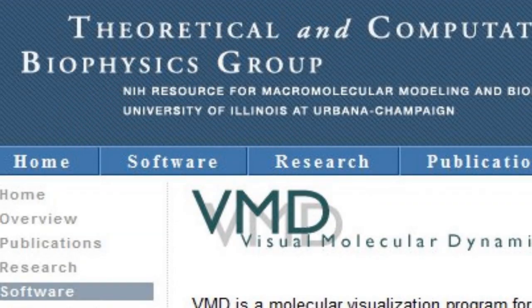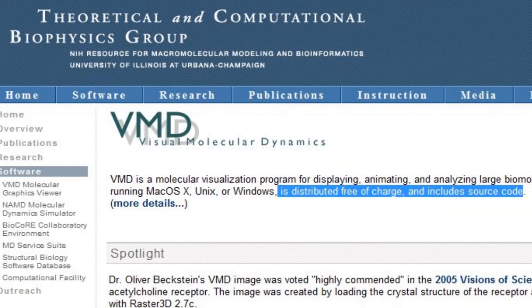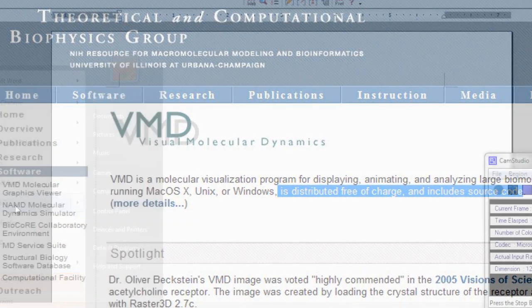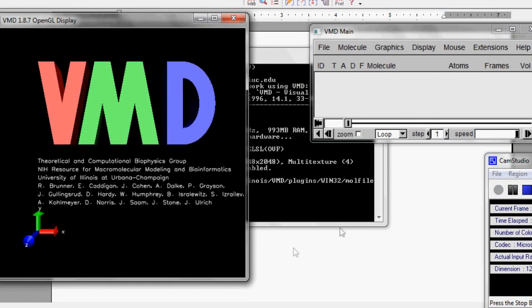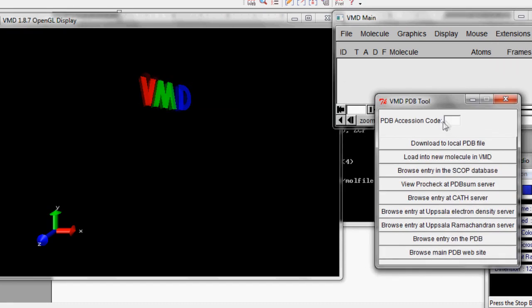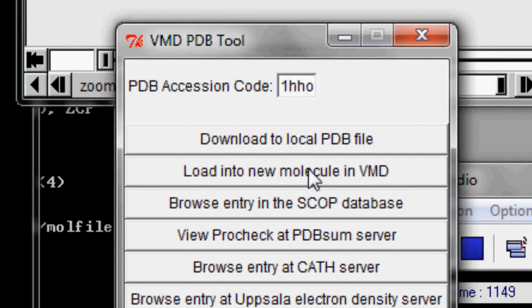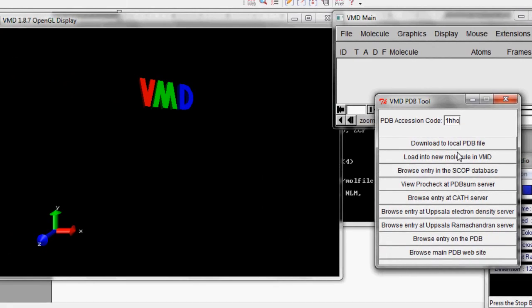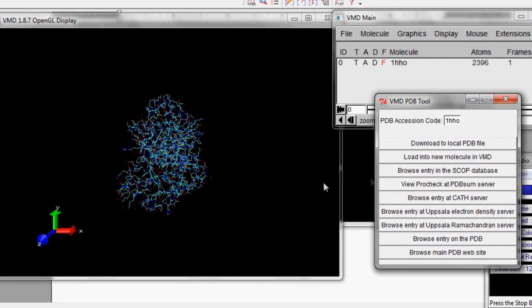So go to the website below and download the software VMD. You'll have to sign up to do this. Start VMD and go to Extensions, Data, PDB Database Query and type in the accession code 1-H-H-O, and then click on Load into New Molecule in VMD. Boom. There you go.